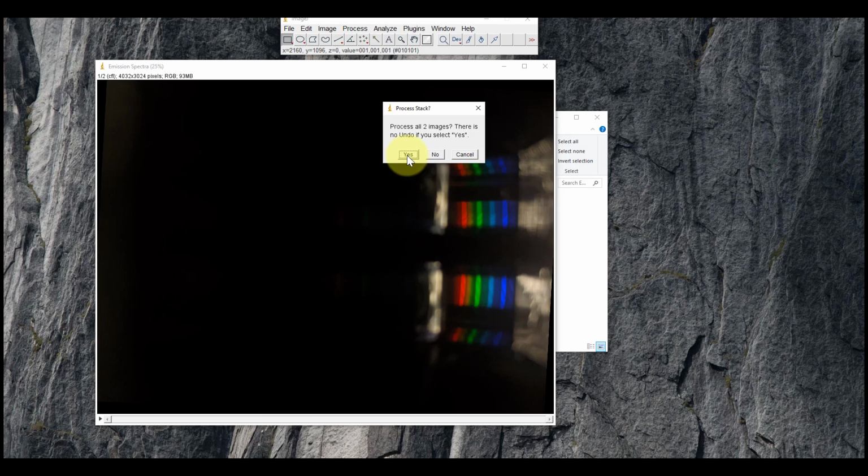This is really important at this point to also identify, though, that you don't want to move your camera at all between taking these photos. That's why we have the Velcro installed. You don't want to position your phone every time. Otherwise, this spectrum is going to shift in the field of view, and then when you try to apply the same rotation function or any other cropping features we do later, it's not going to work across all the images. So it's really crucial to just set up your phone for the series of images that you need or want to collect, and collect them without moving anything. You don't want to move your lamp, you don't want to move your cuvettes, you don't want to move anything. You want to keep everything as consistent as possible, just like you would do in a lab, trying to maintain reproducibility and consistency across experiments.